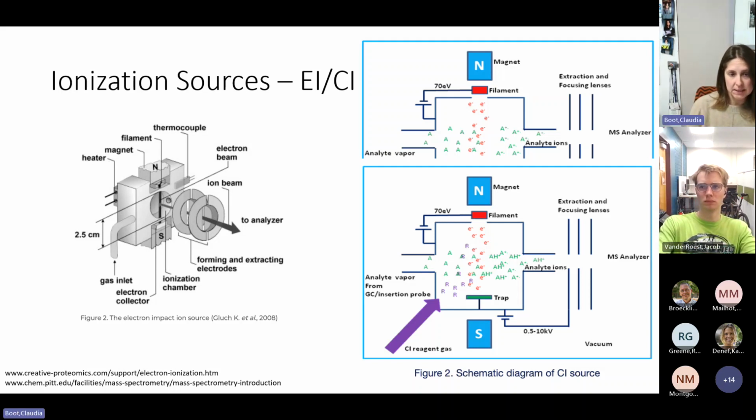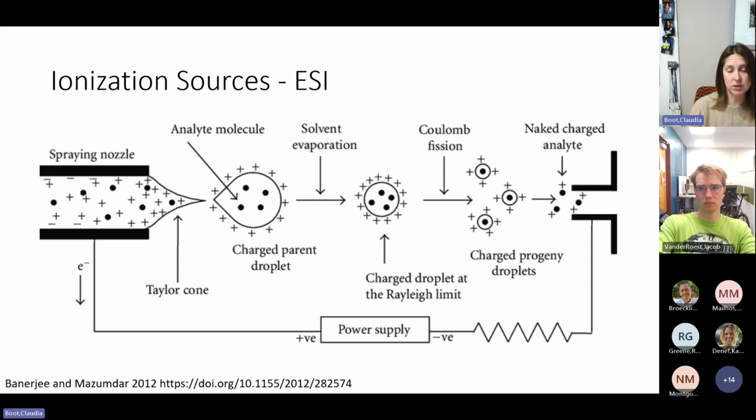This is, like I said, the front end of our GC systems. For our LC systems, the ionization source is usually electrospray ionization. The process of electrospray ionization is shown here, where you have your liquid sample coming in from your LC system. There's both a voltage applied across this gradient as well as a heating gas, a drying gas. As the electrospray droplets are produced, the solution is being evaporated, and the charge being carried on the solvent basically comes down to this Rayleigh limit, where the repulsion from the like charges overcomes the electrostatic interaction of the droplet, and there's this Coulombic explosion that happens.